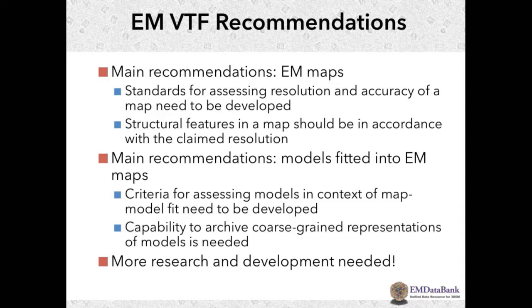So for models fitted into EM maps, again, the criteria need to be developed. If you're familiar with X-ray validation, there's such a thing as real space R factors.